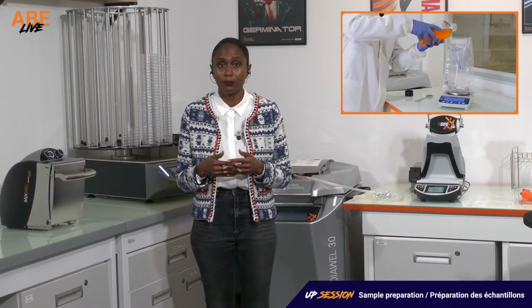So for the dilution step, you have different methods. The first one will be the manual method. In this method, you take your sample and you put it on a scale, the precision scale. And with the weight of this sample, you need to calculate the volume of diluent that you will pour on the sample to obtain your dilution. So it's a fastidious method.